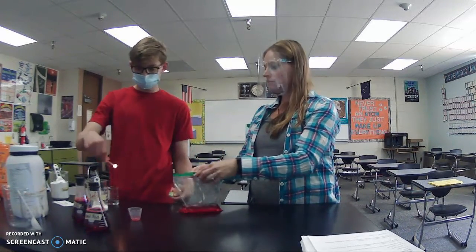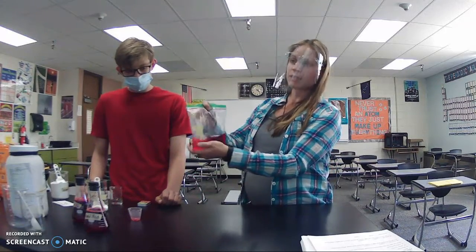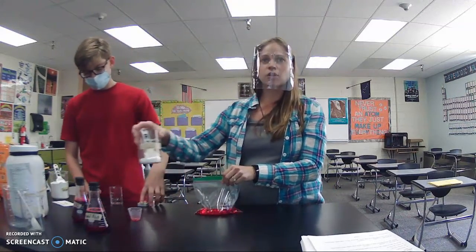Okay? Very good. Yep, he put it into our dump beaker. There's a little bit of water in there. So that was a negative test. There was no gas produced when I mixed the water and the phenol red. Okay? Our next step is to add calcium chloride.